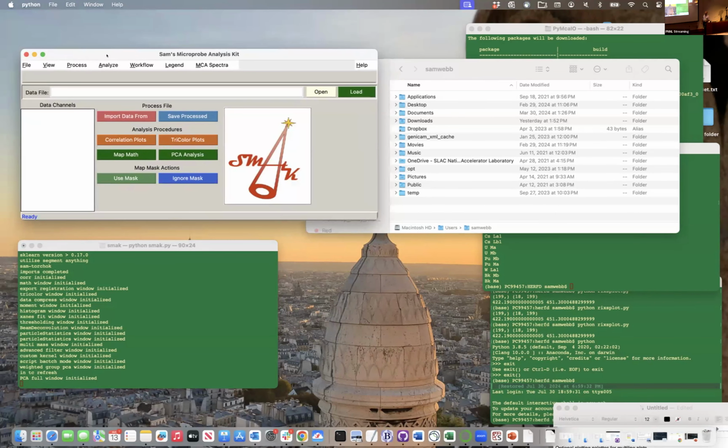This software has been a project that started almost 20 years ago, and it's been developed through a lot of user suggestions, shall we say. Not always complaints, but always suggestions, right? A lot of the features are based on what people have asked for. It's always a living thing, so if you would like to see features, I always welcome those emails as well.